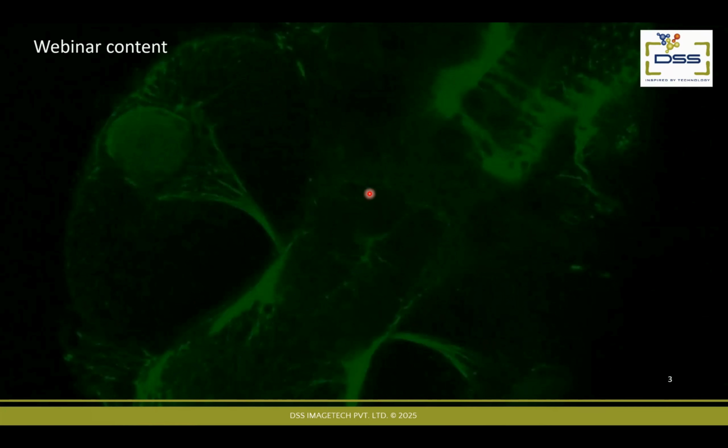So even though the topic is multiphoton microscopy, I am aware that not all of the attendees in the meeting might have an up-to-date background in fluorescence and confocal microscopy. So to make sure that once we reach the step of multiphoton microscopy, we are all on the same page, I'd like to start off with a bit of basics.